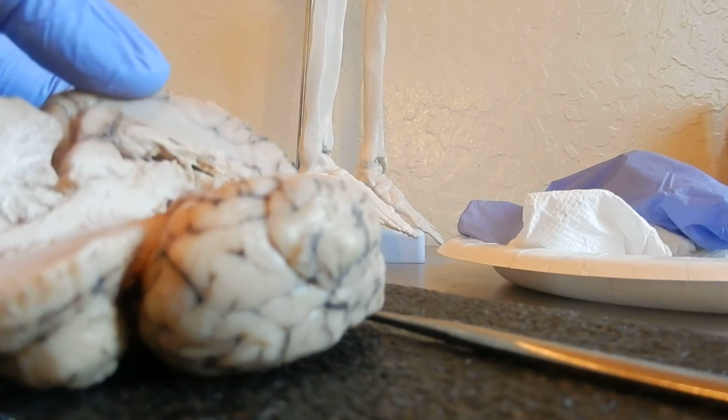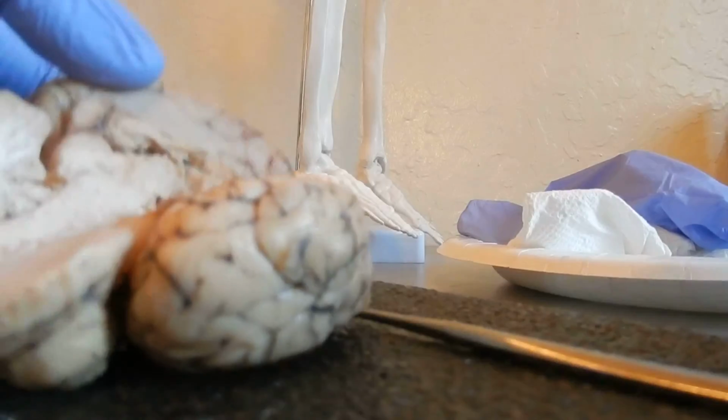Alrighty, so we've looked at everything inside of our brain. I hope this was helpful.